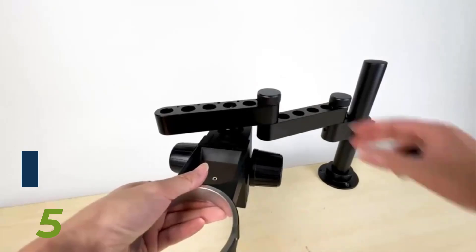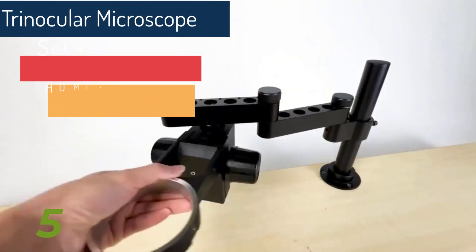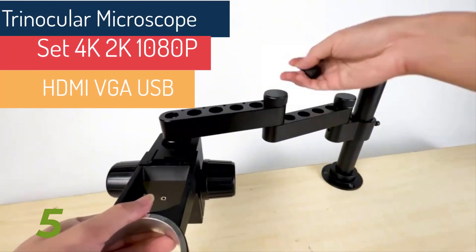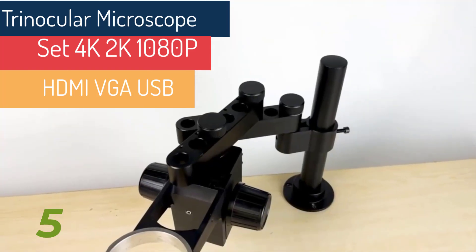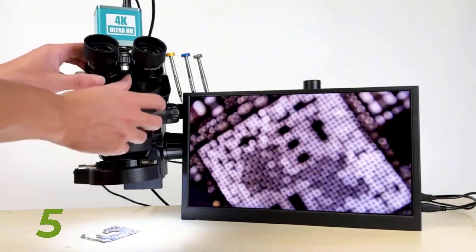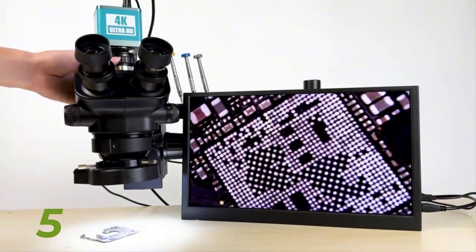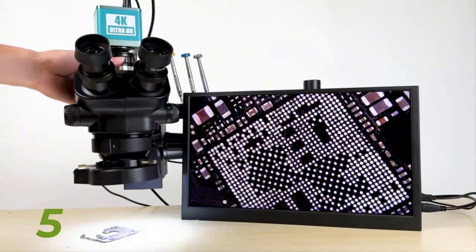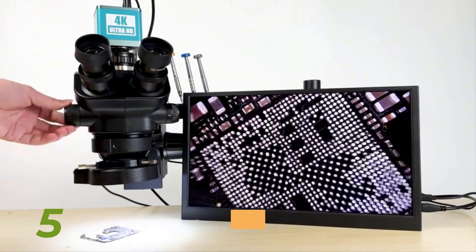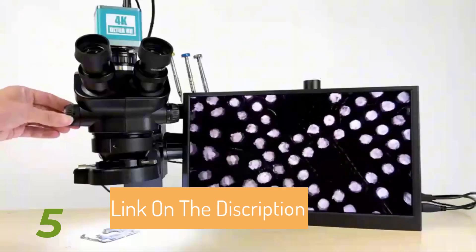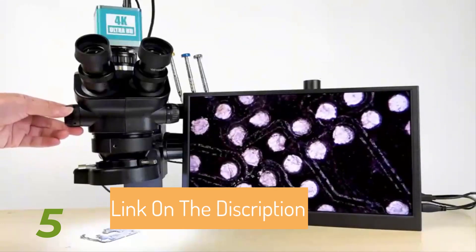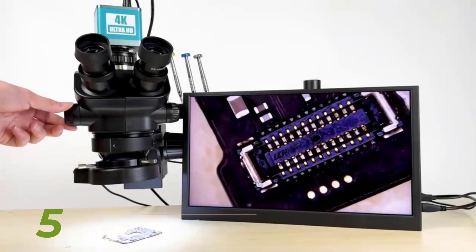The stereo microscope head provides a sharp three-dimensional erect image over a wide field of view, making it suitable for various applications from biological research to electronics repair. The ergonomic design includes a 45-degree inclined and 360-degree rotatable binocular head, adjustable interpupillary distance, and diopter adjustment in both tubes, ensuring comfort during prolonged use.